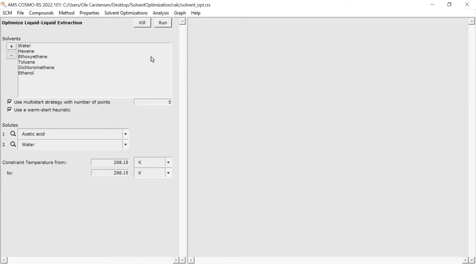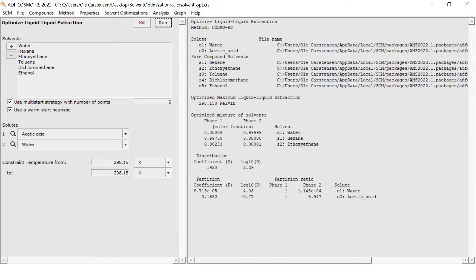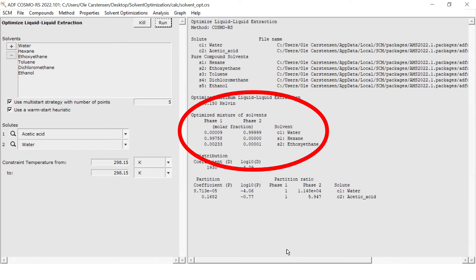To start the optimization process I click run. Within a couple of seconds the results will be displayed in the right window and indeed N-hexane is chosen, though the program suggests adding a tiny amount of ether to the mix.